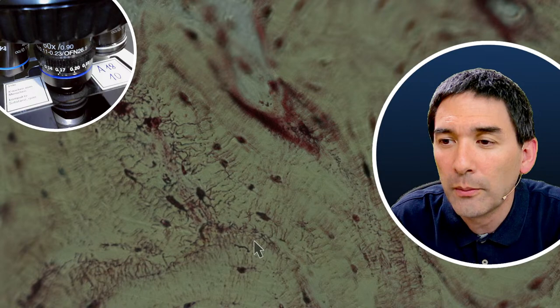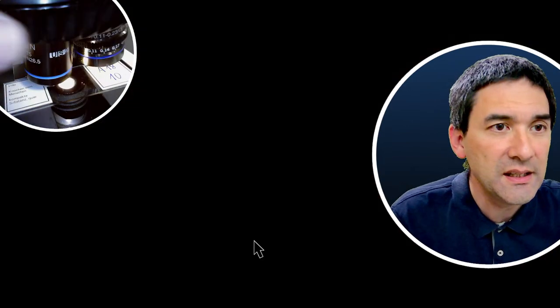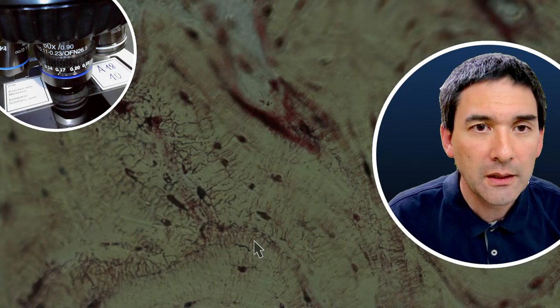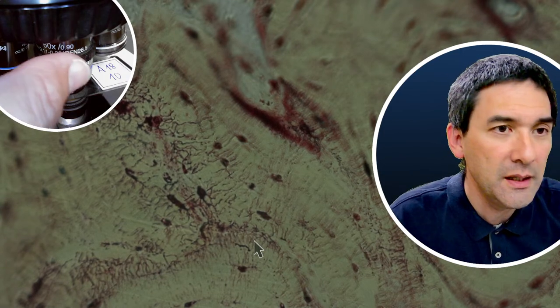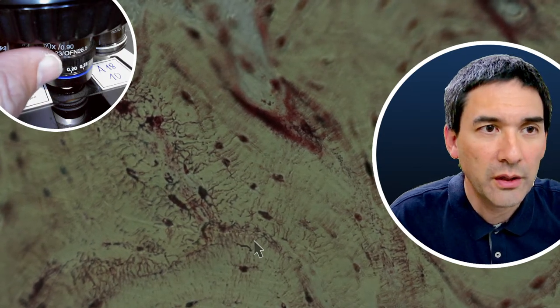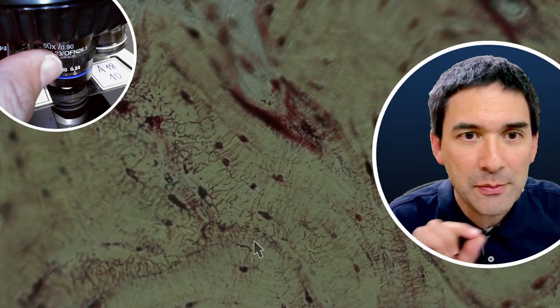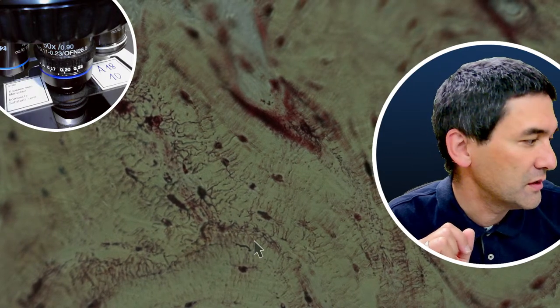I'm going down again, I hope I'm not overlooking anything. Otherwise, I'm just going to move on to the next slide. This is, by the way, 60 times. I also want to illustrate something here that maybe I did not show you yet. This is my 60 times objective, and it has something you can turn here. You see this? This is a fine adjustment to adjust for cover glass thickness. When everything is in focus, you're supposed to adjust it in such a way that everything is absolutely crisp. Just in case you were wondering.